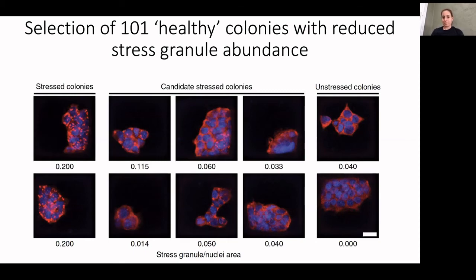So would you be able to quantify on the fly, as you're imaging a given raft, and then say, if you pass a certain cutoff, then you go to higher resolution? We didn't try that. That's an interesting idea. The way that we did it is we captured a whole raft, and then we took that data to a separate computer and processed it, because we were imaging and developing the pipeline at the same time.